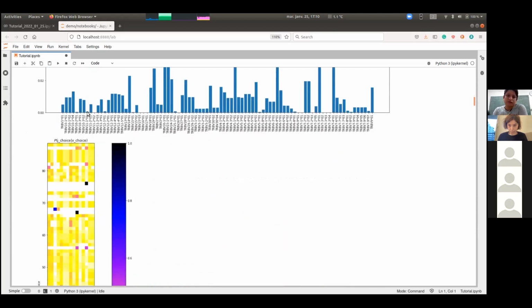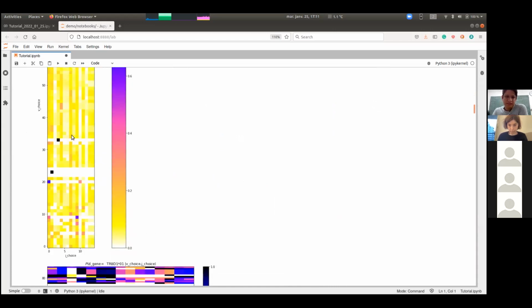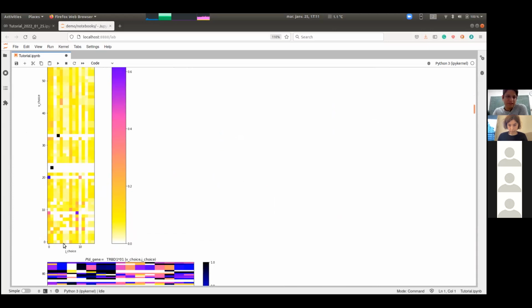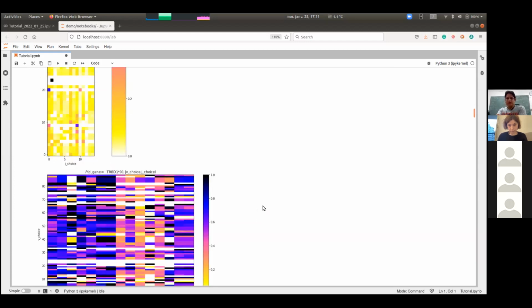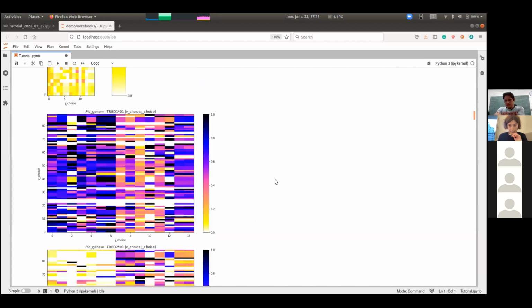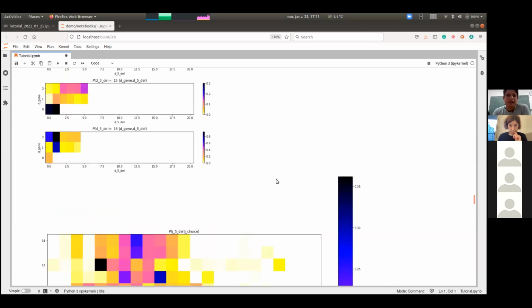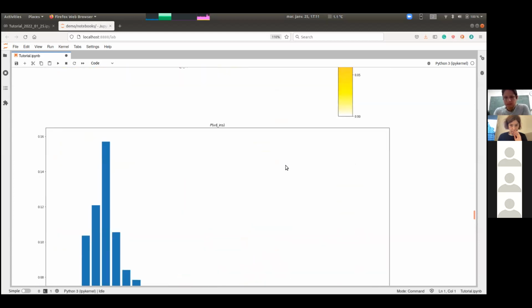And also the other conditional probabilities: as I mentioned in the Bayesian network, the J gene depends on the V. So you can see here, for this gene, this value of probability, and you have all the events of the model plotted with just this one command, that you can visualize and extract your own conclusions from, right?